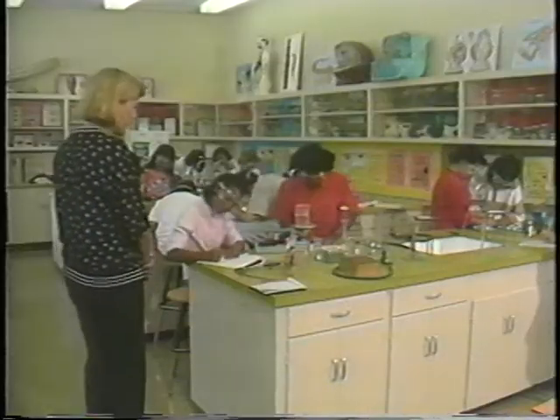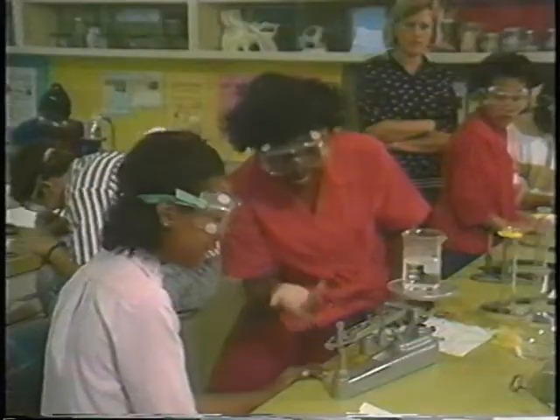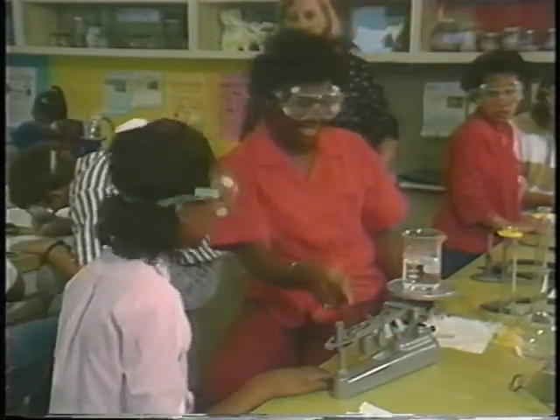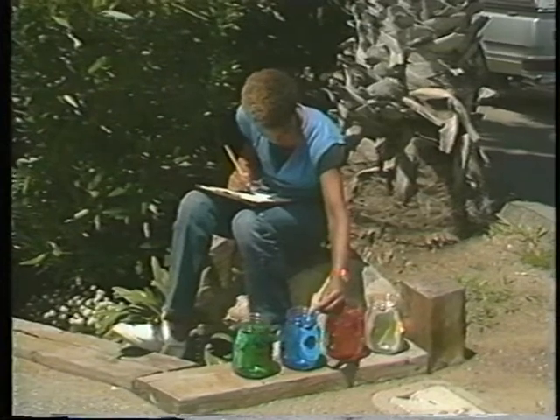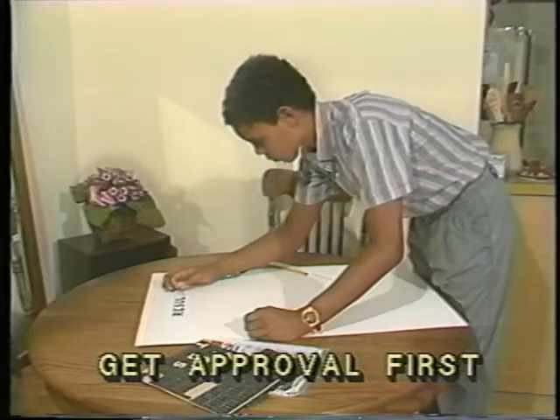Listen closely to verbal directions given by your teacher, and if he or she calls for attention while you're working, immediately stop what you're doing and listen closely. Always work with a lab partner, and whenever you're measuring something, ask your lab partner to double-check your measurement. If you both can't agree, then ask the teacher to check it. And if you're ever doing your own science project at home, make sure that your project plan is safe. Have it approved by your teacher first.